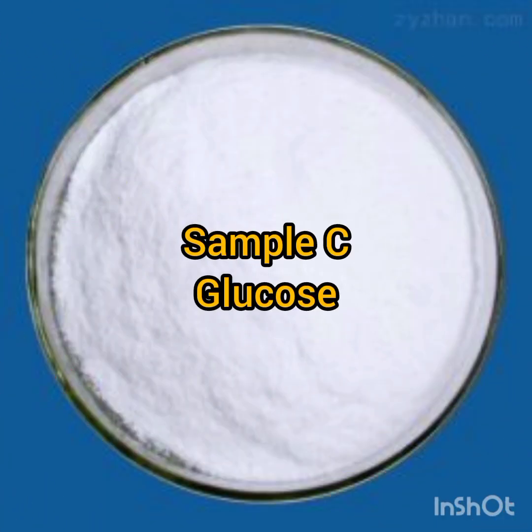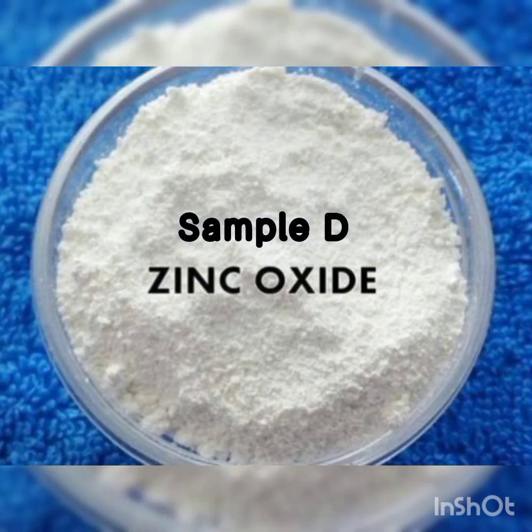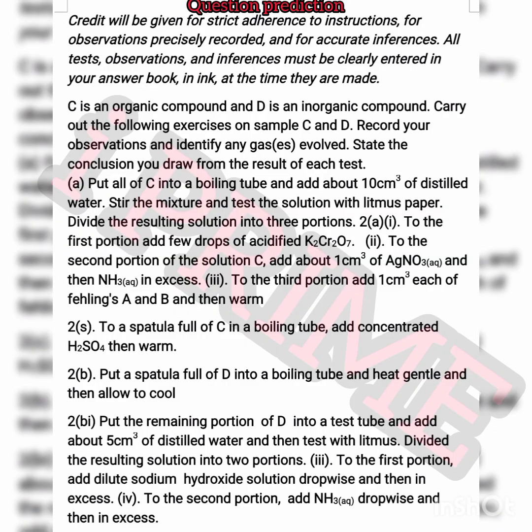Now we'll be having these two compounds, sample C, glucose, and sample D, zinc oxide, to be testing or working on. This is a question, or likely questions, you should be expecting.